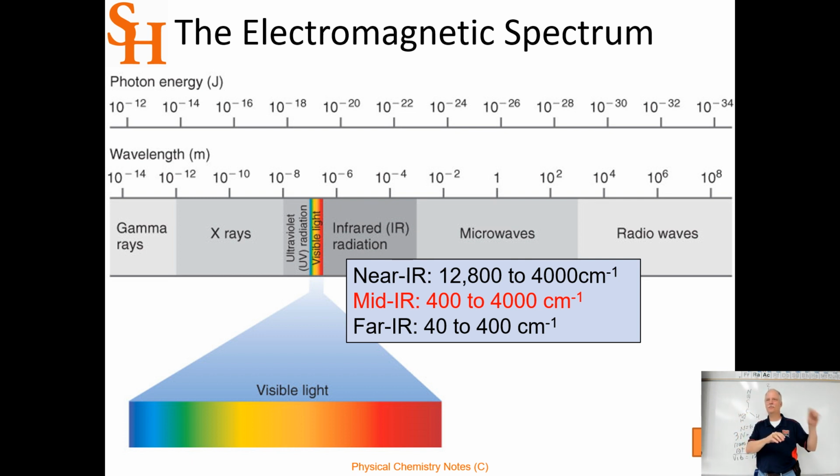And he said, all right, let's do a pulse. And he pulsed the radio frequency and it pulsed the protons in that molecule, and we heard it on the radio. And it was like clink, like someone hitting a piece of metal, and you didn't really hear much. And he said, now let's shim the magnetic field so that all those protons are in the exact same magnetic field strength. And so he shimmed the magnetic field and punched a pulse again, and it was like someone rang a bell. Bing! On the radio station.